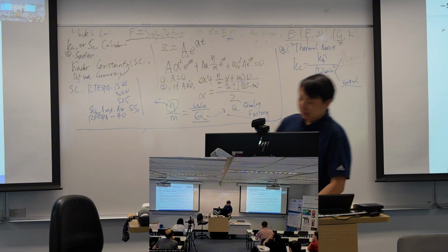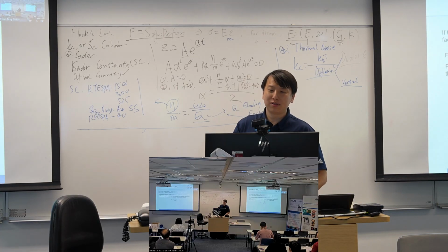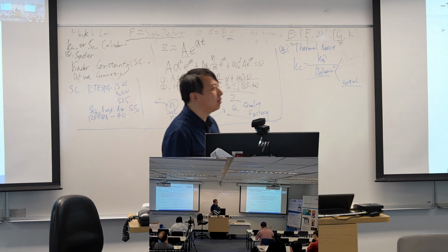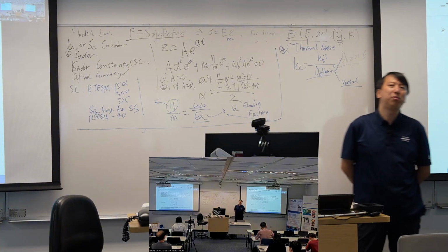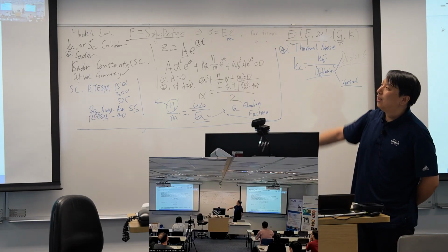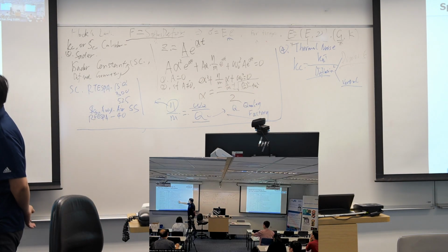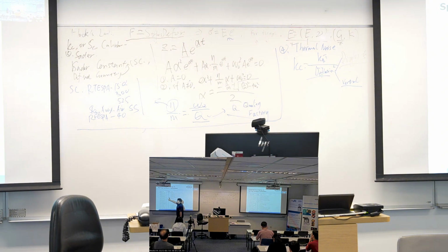Okay, so we make a small summary. All these methods were established maybe 15 years ago, around 2010. Bruker application scientists published lots of papers to discuss the calibration stuff. And they even made a summary to tell you the uncertainty of each step.